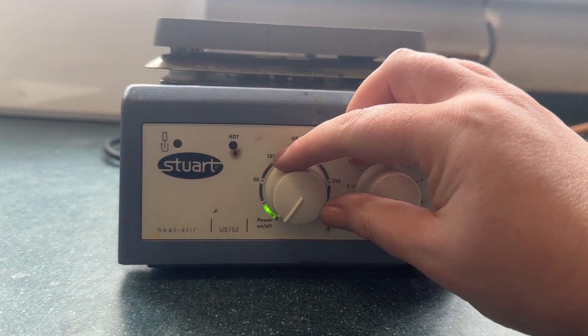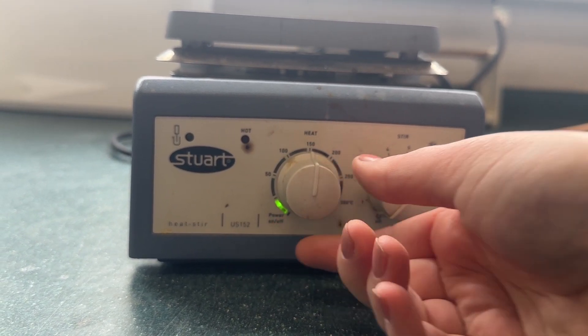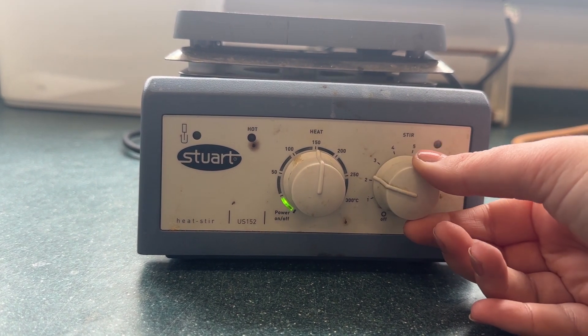Let's now look at some methods that you can use when you want to heat something which is flammable. The first is the use of a hot plate. This is a metal plate which you can set to a certain temperature. Here I've set this to 150 degrees.